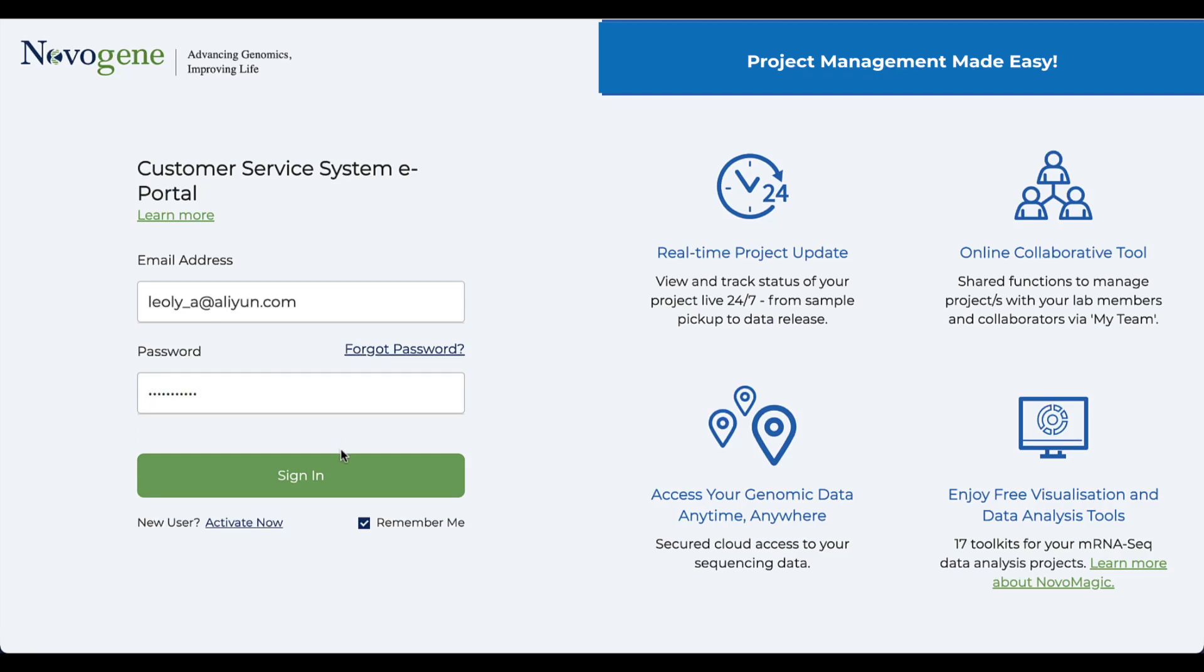Welcome to this tutorial for Novogene's customer service system. This is where you can see all the projects you have with us, upload sample information, start library preparation and sequencing, and track project progress.